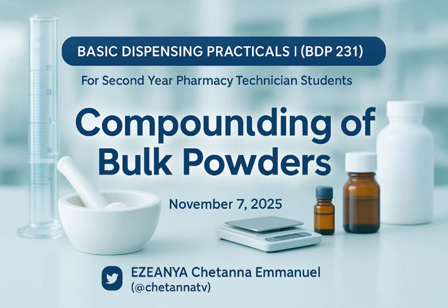Now, another thing I want us to look at is, you did geometric dilution in your first year, right? When mixing powder. Were you taught that? Okay, it's okay. Let's go through it. I think that's the last thing we'll do. Then you start to have practical work.